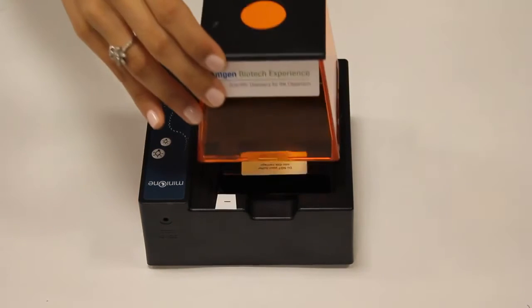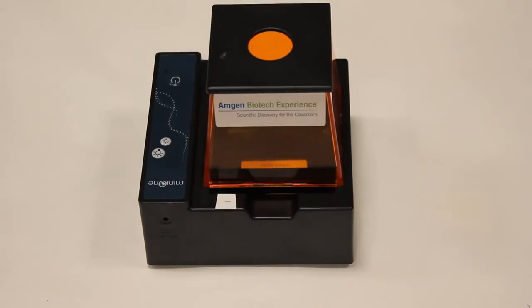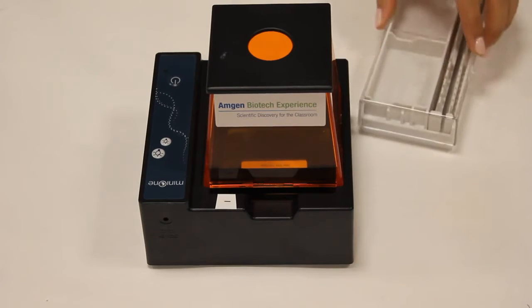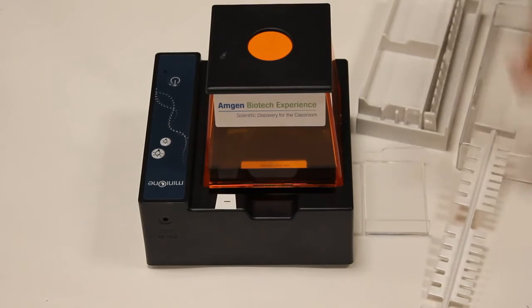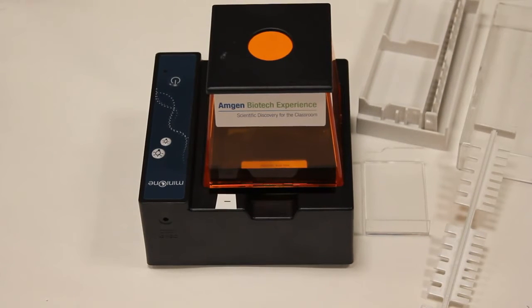It comes with a hood, gel casting trays, combs, and electrophoresis chamber.